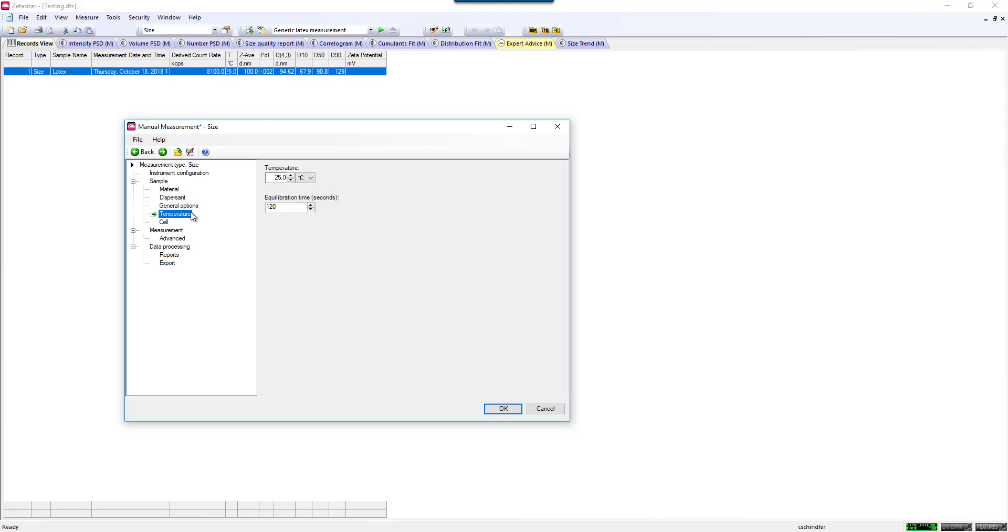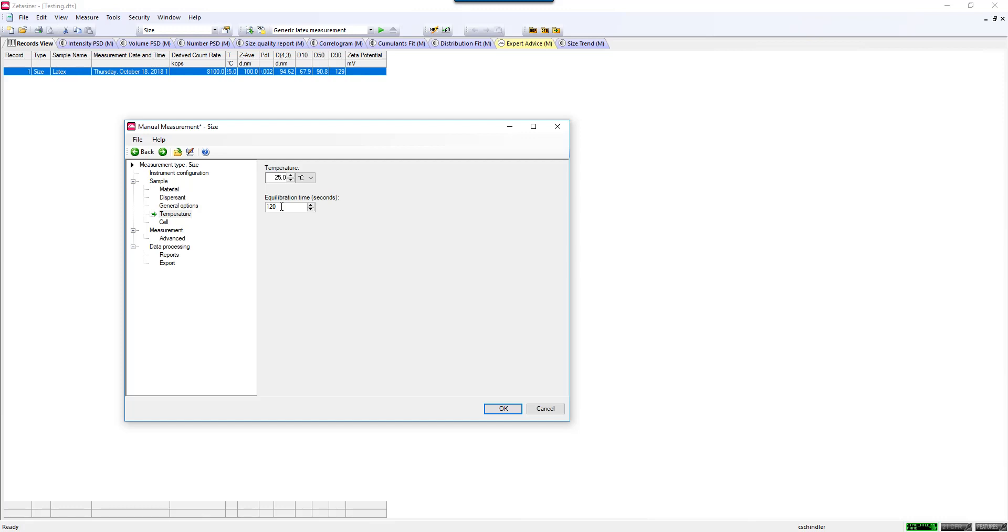The more critical component is temperature. You need to know the temperature that you would like to measure the sample at. The system has automatic temperature control based on what you select here. The equilibration time is a time built in to make sure that the sample comes to the exact temperature of the instrument as the Peltier is heating and cooling the sample. Typically, you might enter between 30 seconds to a couple minutes depending on how different of a temperature you would like to measure.